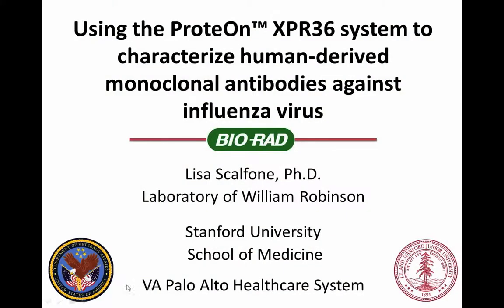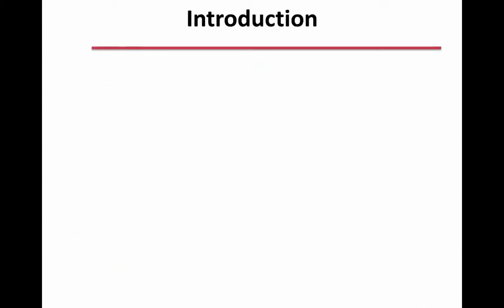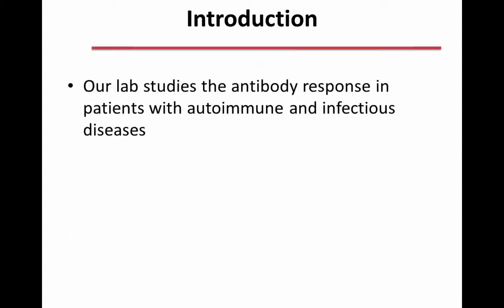Thank you for this opportunity to present the work that our lab has done using the ProteOn XPR36 system to characterize the binding affinities of monoclonal antibodies with their cognate antigens. I am a postdoctoral fellow in the lab of William Robinson at Stanford University, and our lab studies the antibody repertoire in human subjects with autoimmunity and infectious diseases.